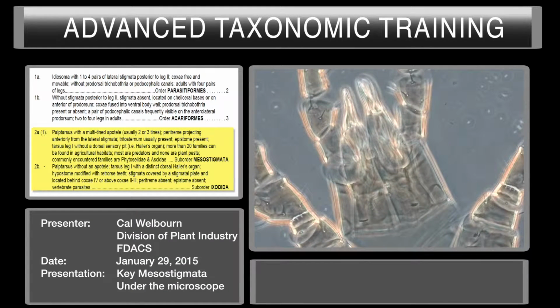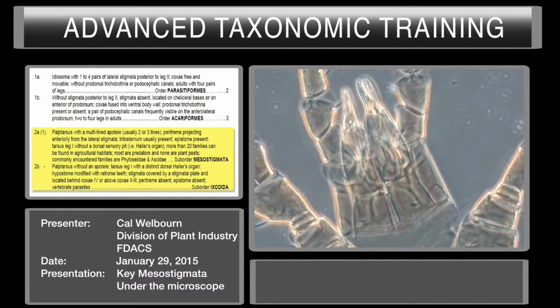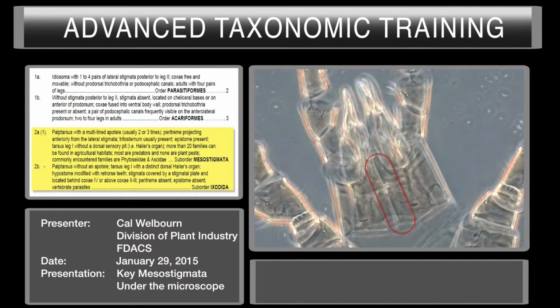Now looking at the ventral side of the gnathosoma, we have your hypognathal groove right in here. This isn't well developed in this particular one. Here you can see the chelicerae bases, and in Mesostigmata there's usually two segments. In the Prostigmata and the Acariformes there's just one segment. The hypognathal groove doesn't show up very well, but it would be in this area.